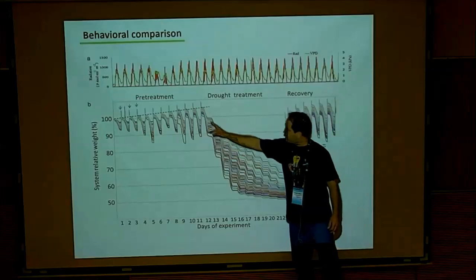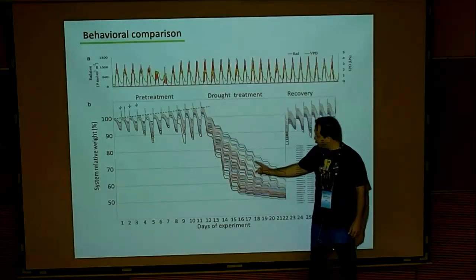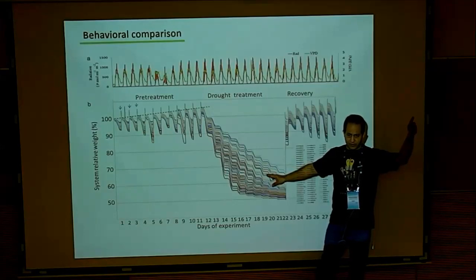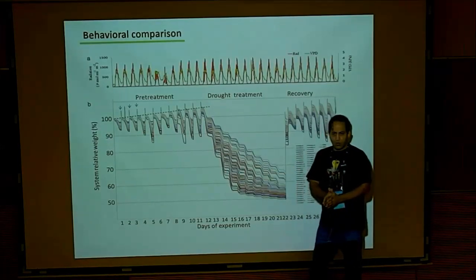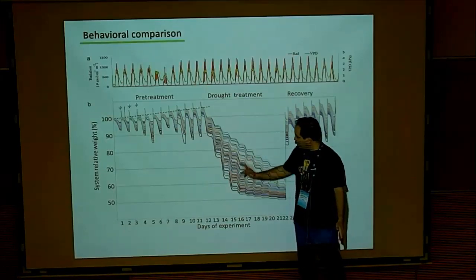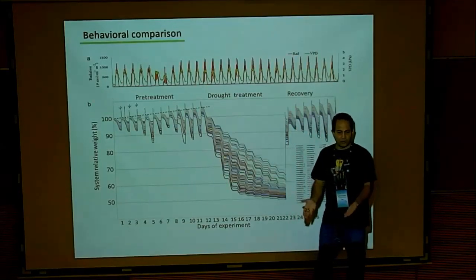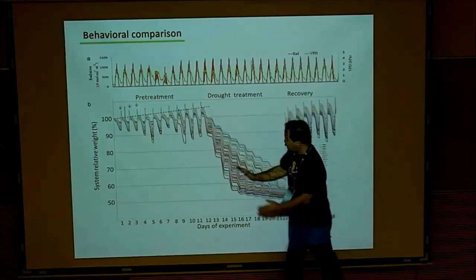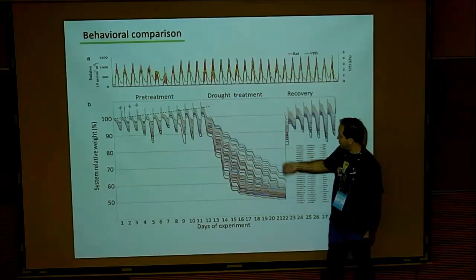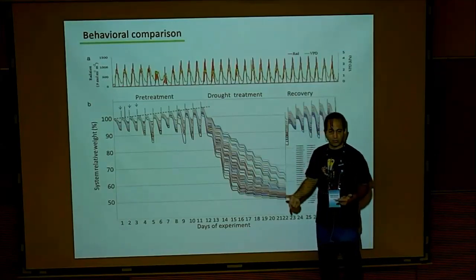This is a typical drought experiment. You see how this is introgression lines, IL of Danny Zamir. Danny Zamir is a professor here in the faculty. So we just want to see how much variance there is in this library. Huge variance in just the response to drought. All of them respond at the same time, but look at the gap. Here we recover them simultaneously, but of course we can recover each one based on its own performance.